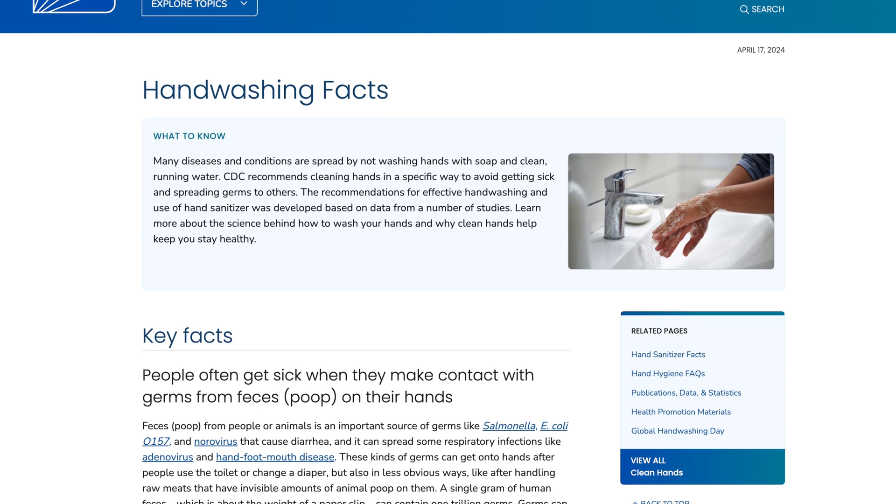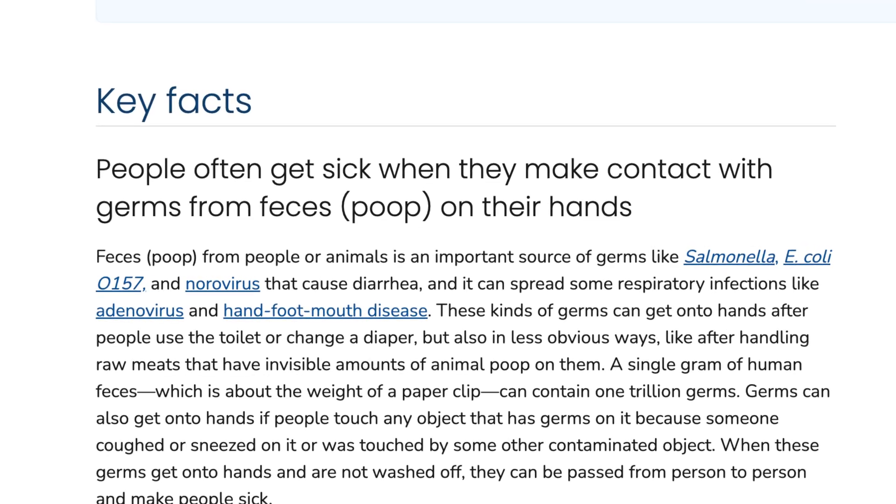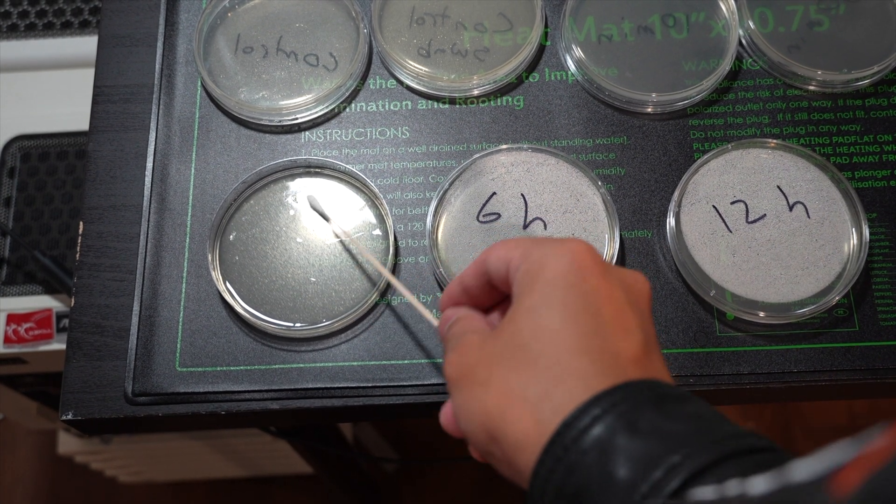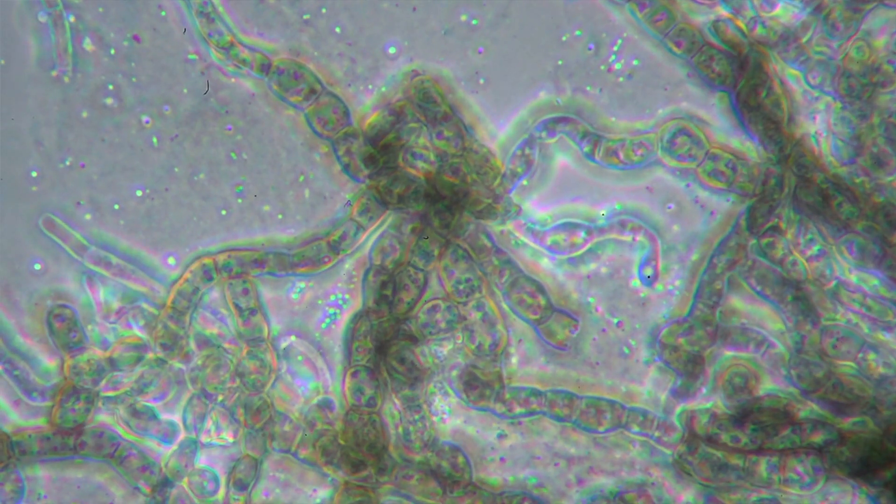However, today I'm really going to put that all to the test, as well as my immune system. The CDC clearly outlines the benefits of hand-washing, from simply getting rid of poop particles to some save-the-kids propaganda. For the next 24 hours, I'm not going to wash my left hand, and then I'm going to swab it at regular intervals for science. After incubating these samples in some agar, we're going to use our senses and microscope to try and figure out just what grows when you stop washing your hands.